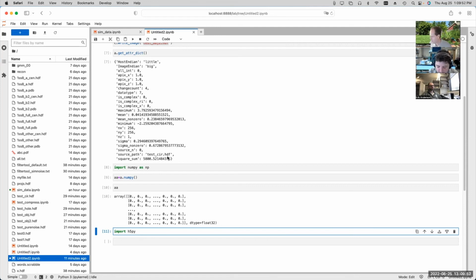So is there a motion correction software that will write out HDF files? Natively, you mean? I doubt it. I'm not aware. MotionCor certainly doesn't have HDF support in it. So right now, I'm not aware of anything that will immediately produce HDF files. You'd have to run e2proc2d and convert it to an HDF file, and then you can delete the MRC file. Okay.